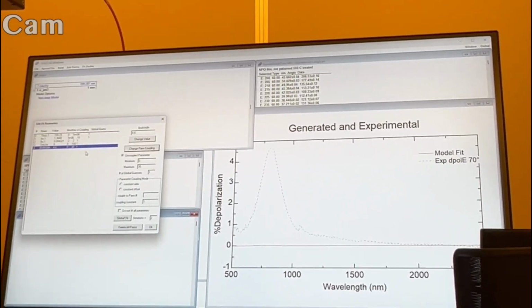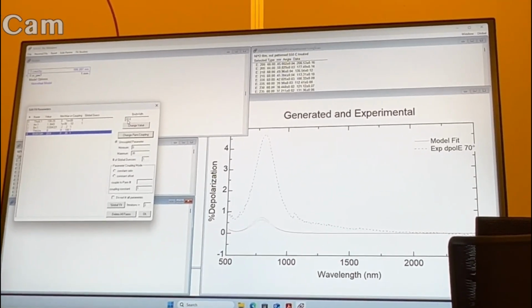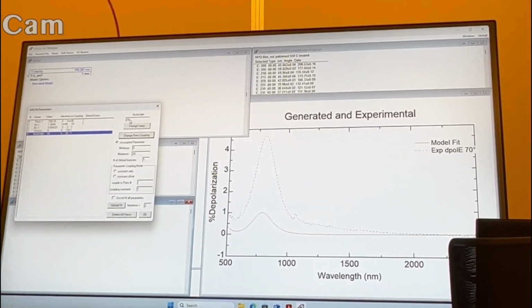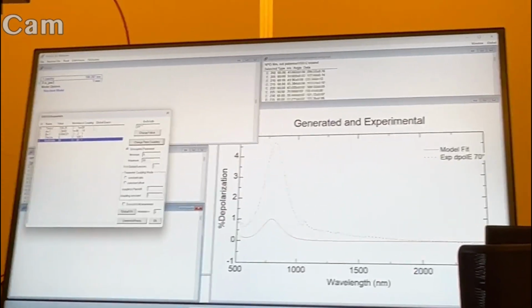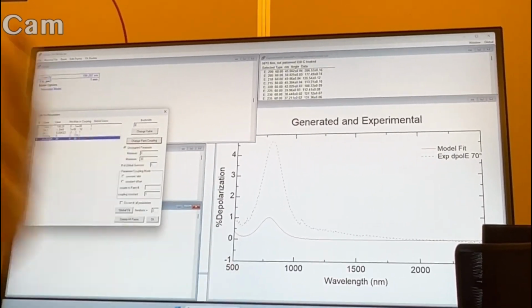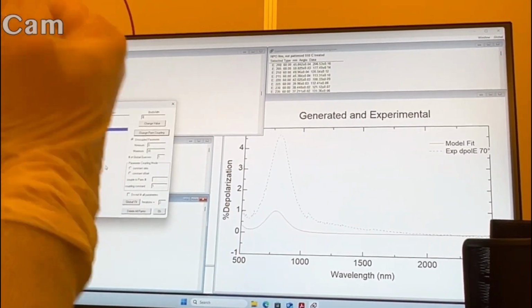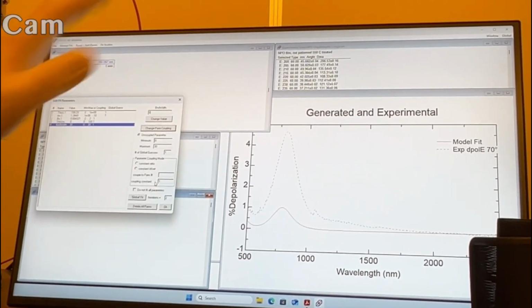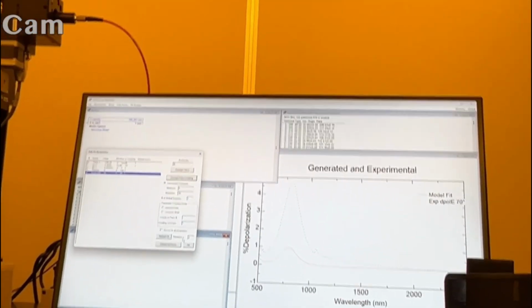So you could always fix it at a nominal bandwidth, but sometimes it depends what's the dominant effect. I can guarantee that I can't go past 30. We don't have 50 nanometers of bandwidth, okay? So either I say the dominant effect here is probably the thickness non-uniformity, or they don't just add up together, but sometimes I just say, I know what my bandwidth is, I'll fix it here, and I'll add the rest into the thickness non-uniformity.